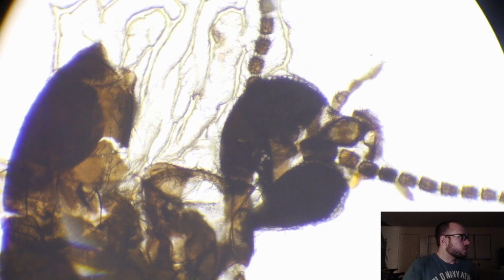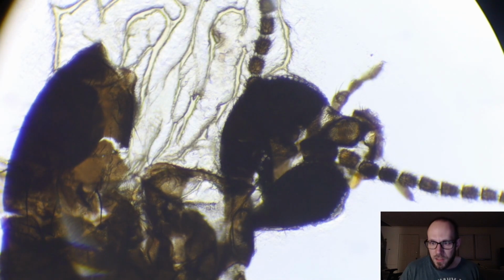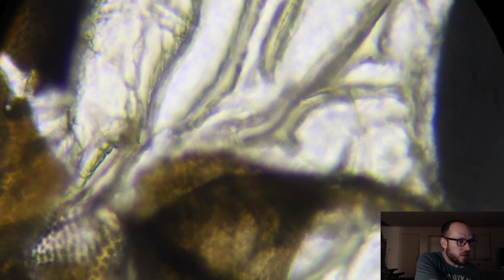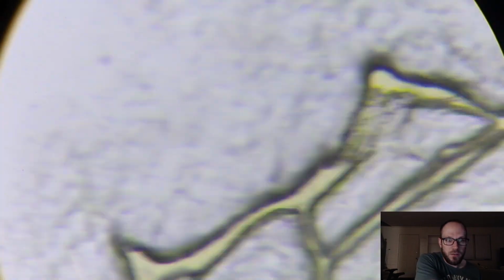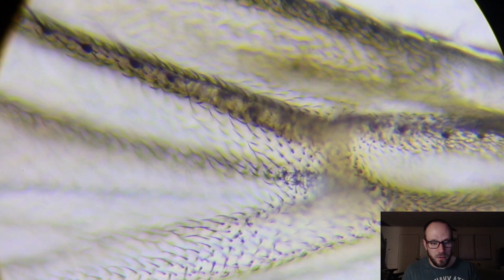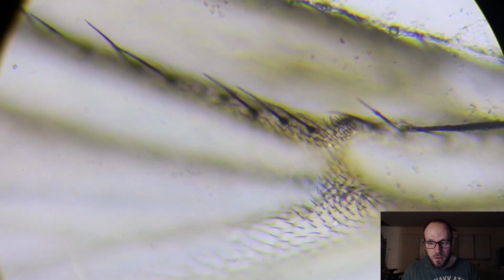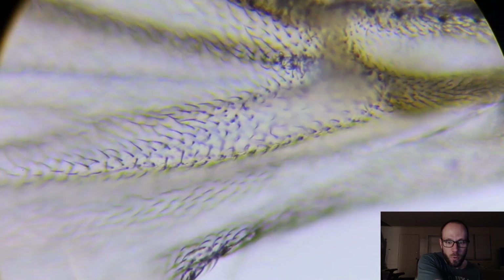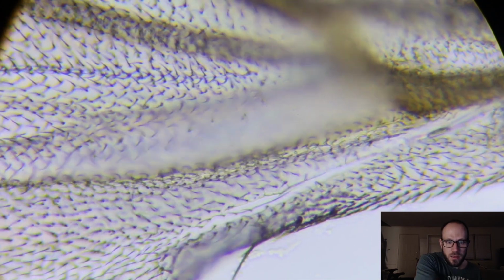Well, I'm not too concerned, because what we're going to do now is go to Darkfield. So let me put it back. Let's check out 400x first, just so you guys can see the magnification here. So this is 400 times magnification. Very high detail, but very, very thin depth of field. These are those hairs on the wing that you can see. I don't think many people think of hairs on a wing, but it's covered in them. Here are his legs, also covered in tiny, tiny hairs.